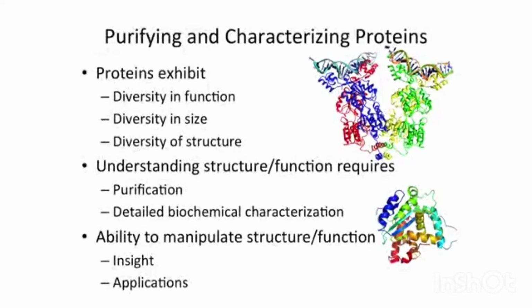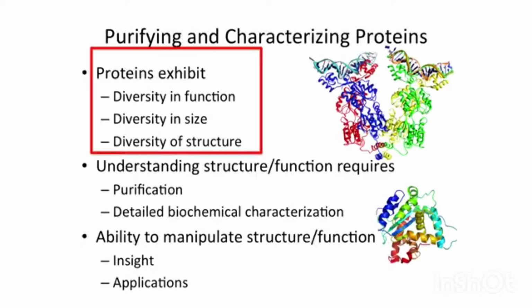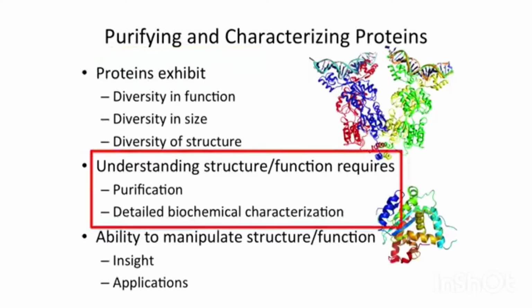To understand protein structure and function, it's necessary to actually isolate, to purify proteins, and then to characterize them. Because proteins vary in their function, their size, and their structure. In order to understand a particular protein and how it does what it does, you have to purify it and you have to characterize it in detail using biochemical methods.